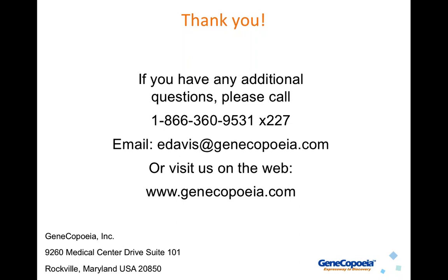Okay, next question. When using the plasmid pCRISPR-CG01, that's one of the plasmids I showed before, you'll obtain a transient transfection, or is it possible to select also stable transfected clones? Yes, that plasmid has the neo gene on it, so you could select for stable clones if you wanted to. We usually recommend not doing that, but it might be useful in some cases where your transfection efficiency is low.